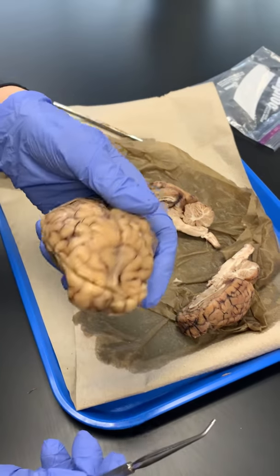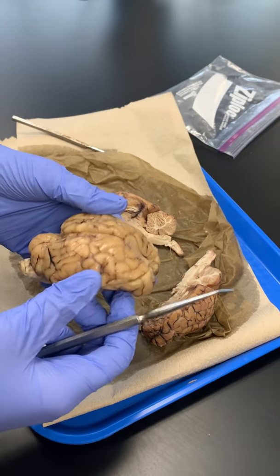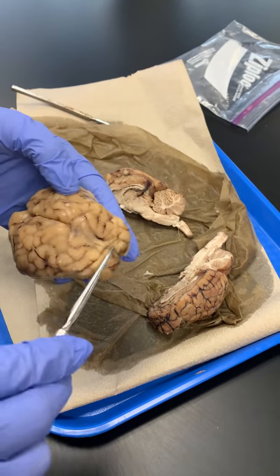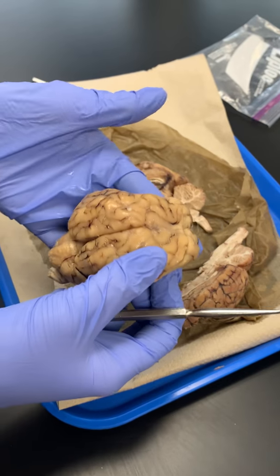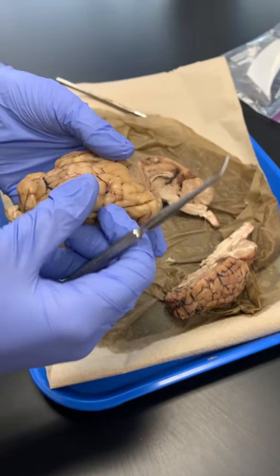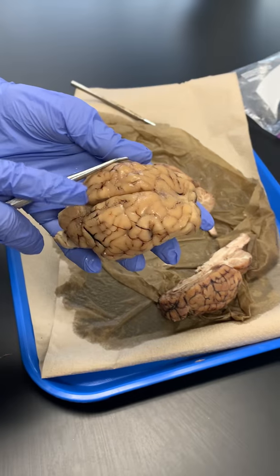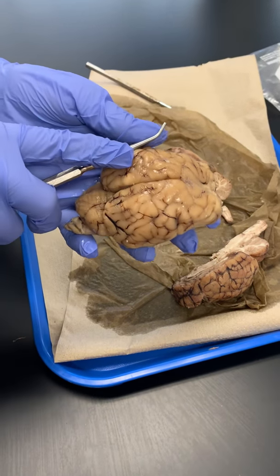So this is a sheep brain, and we have the cerebrum, which wraps around the brain. It's in charge of conscious thoughts, awareness, higher functions, and motor and sensory. It's divided by the longitudinal fissure into a right hemisphere and a left hemisphere. The right hemisphere is in charge of art, music, imagination, emotion, and the left side's senses and motor. And the left hemisphere is in charge of language, logic, math, and the right side's senses and motor.